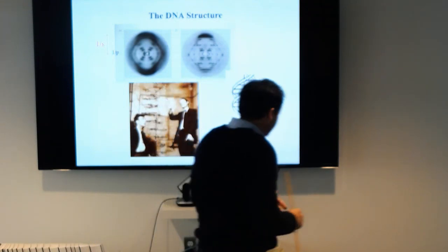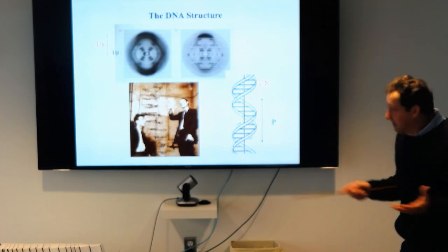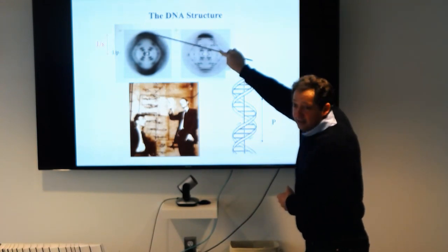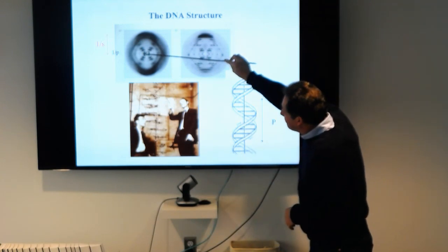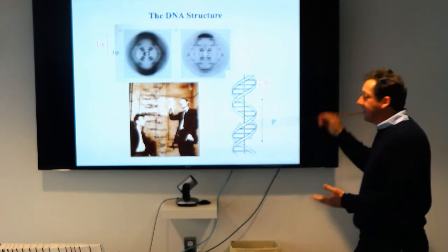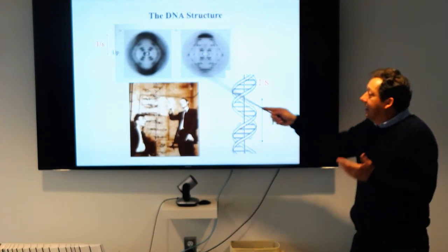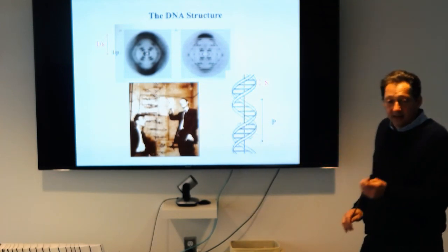This is no joke, that's how the structure of DNA was solved. Quite simple. Watson and Crick stole the picture of Rosalind Franklin. They see this huge, nice peak here. They say, oh, that's the subunit spacing. They see the spacing between the layer lines here and say, oh, that is the pitch of the DNA. So now they have all the constraints with which they build their model. And of course, they immediately realized that because Crick was the one who developed the theory to do that.